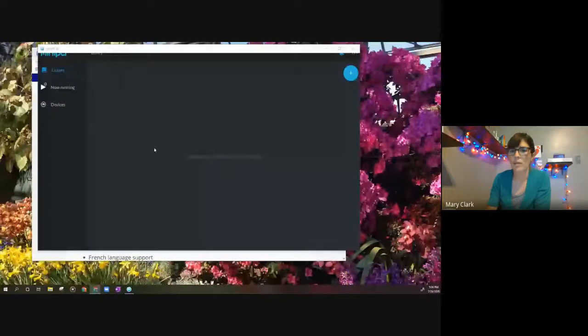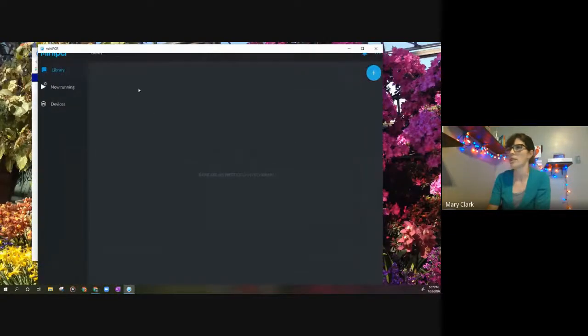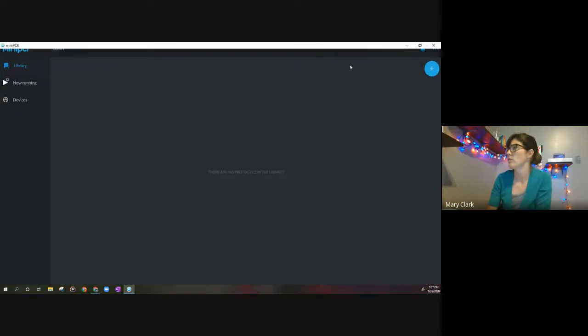All right, so let's look at our mini PCR machine. You'll notice that nothing's running right now, which is fine. There are no programs in here at all, so we're going to have to make one. What I'm going to show you is the program for the crime scene investigation lab. I'm going to click this plus button, and let's see if this works. It's being a little bit funny.